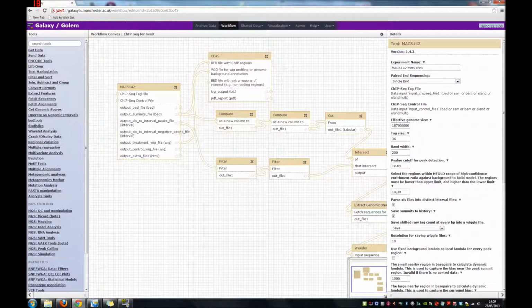So all the options that are in Max are exactly the same as when we ran it in our previous history. Now these items will be kind of set in stone in our workflow. So we won't be able to change this, won't be able to change this, won't be able to change this, because that's how we've set the workflow up.